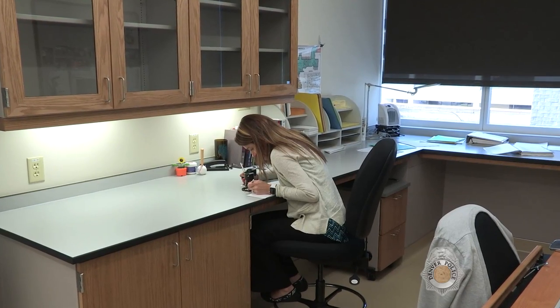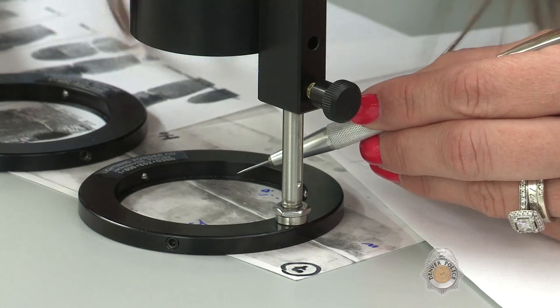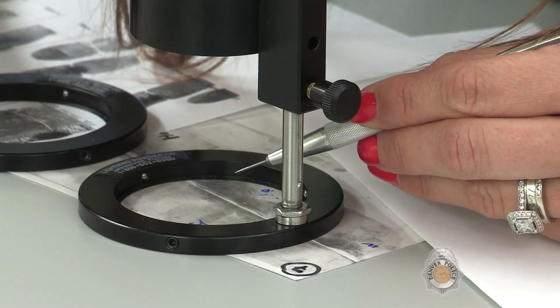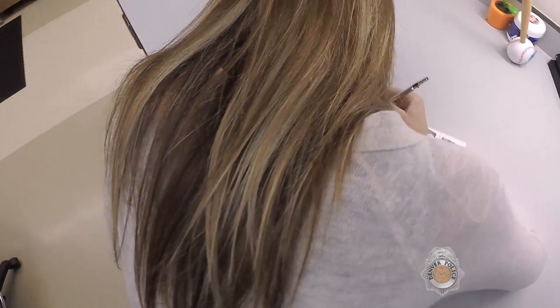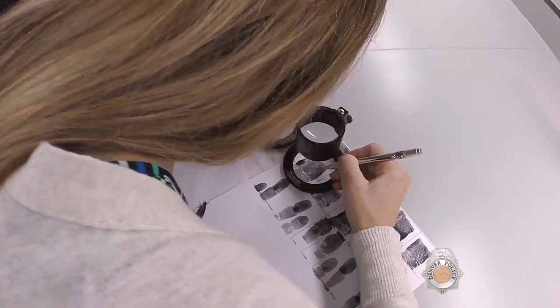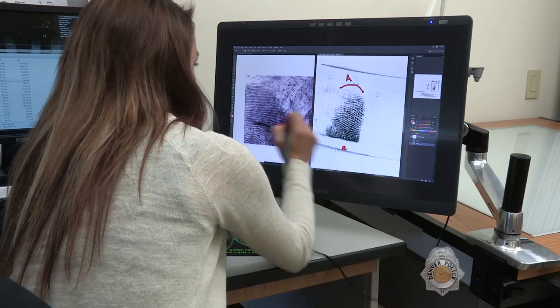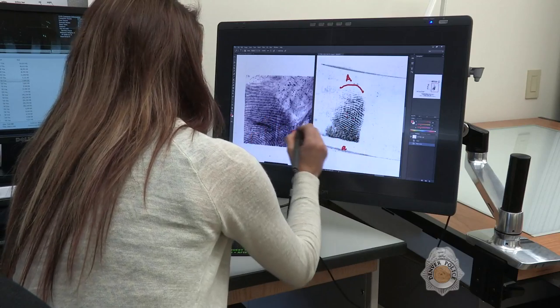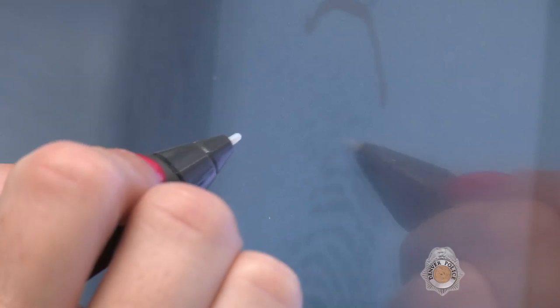If an identification appears likely, the examiner then completes a manual comparison of the latent print to the known print from the database. While there are many tools to assist the latent prints unit in identifying print matches, this final manual comparison is always completed by an expertly trained latent print examiner.